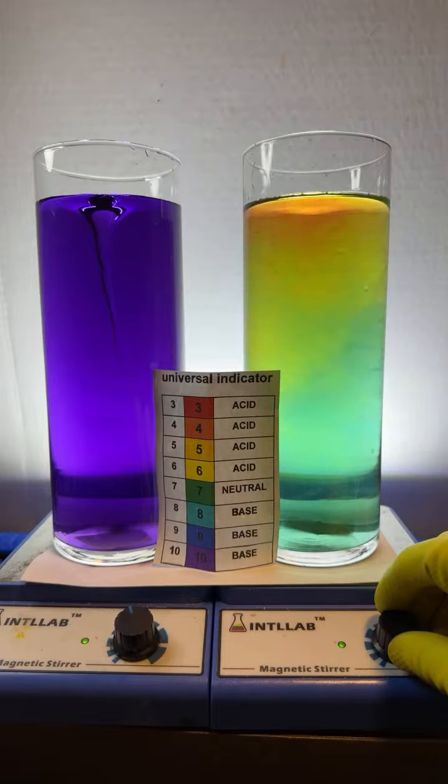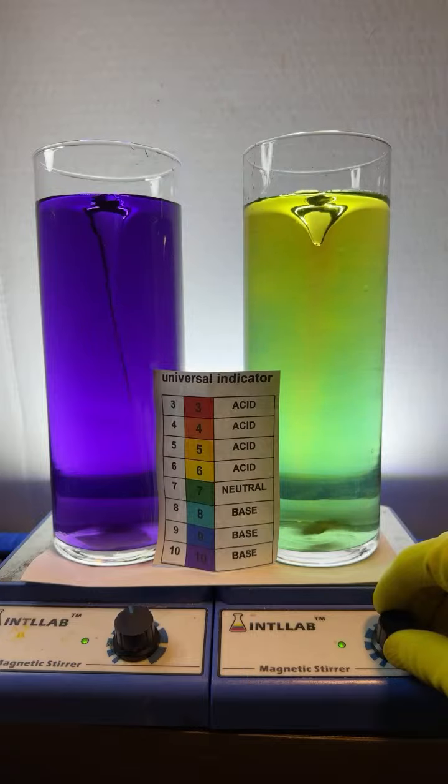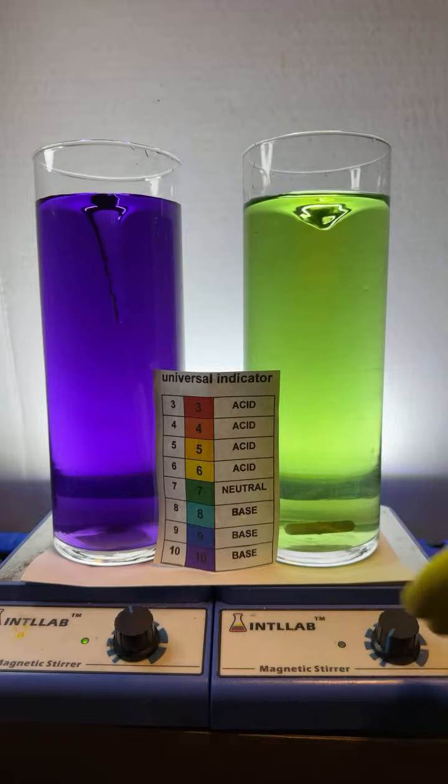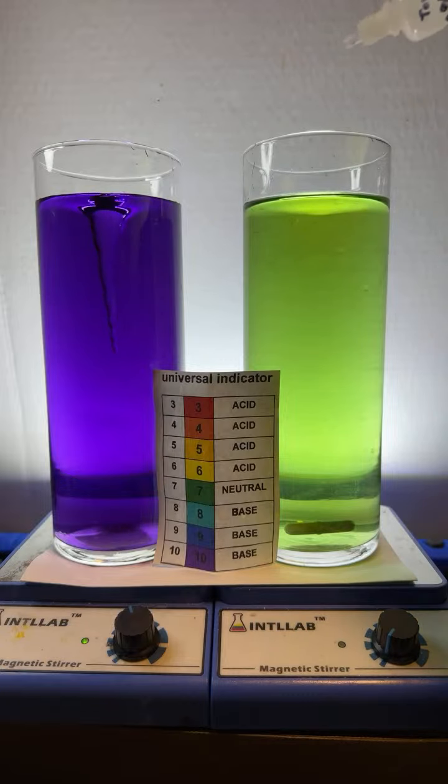Oh, that was gorgeous. This one, looks like I added the acid and base in even amounts, and we've got a neutral solution over here. Okay. So now what we're going to do is we're going to add a little bit of acid over here.